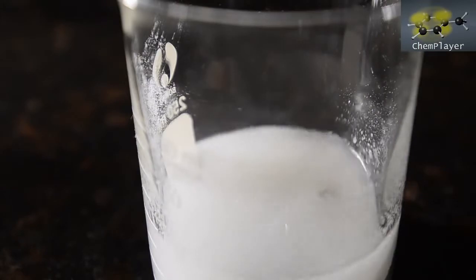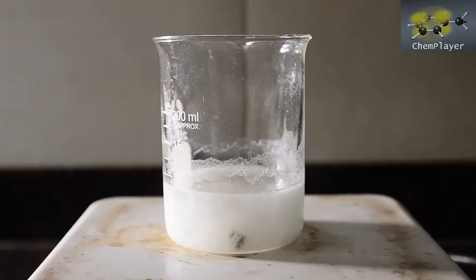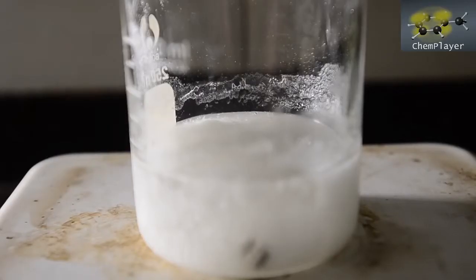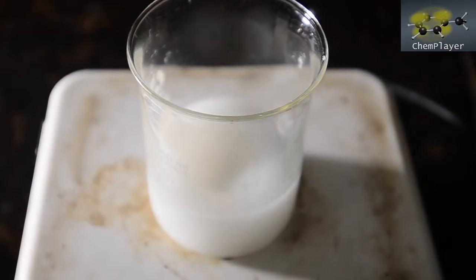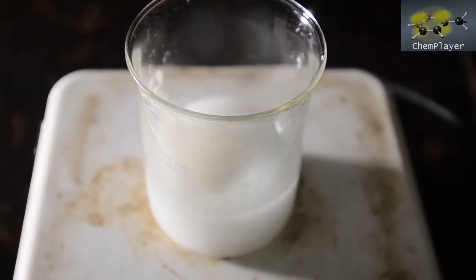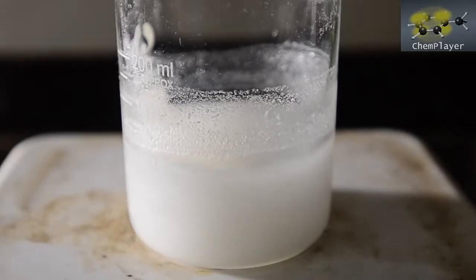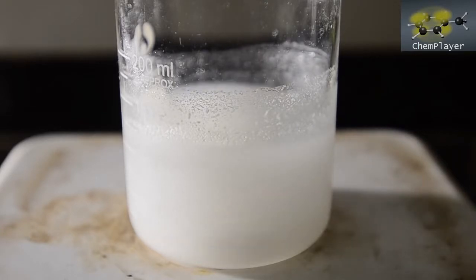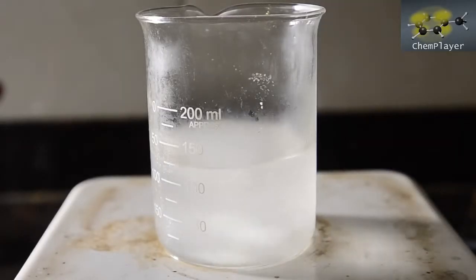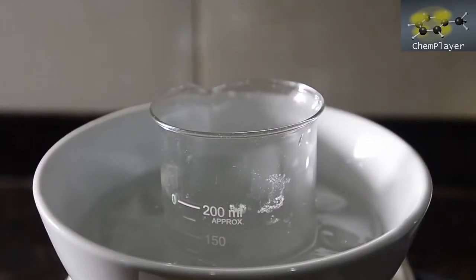And now we'll get this set up on a magnetic stirrer, and start stirring. As the vanillin dissolves, it cools the mixture quite strongly, making it less soluble. We want the mixture cool though, so we need to add enough DCM, so we've got a chilled solution. About 130 ml of total volume, and nearly all dissolved. So now we get this set up in a cooling bath of ice and water.